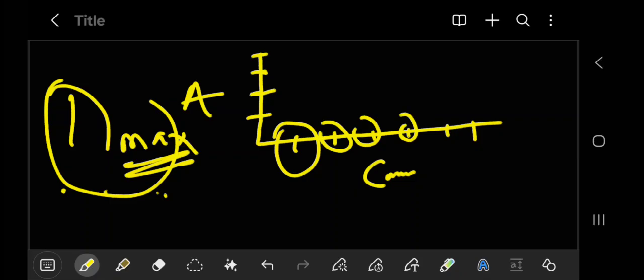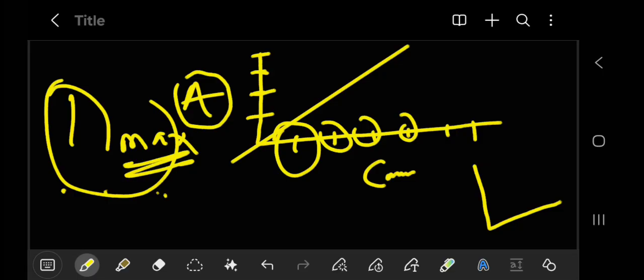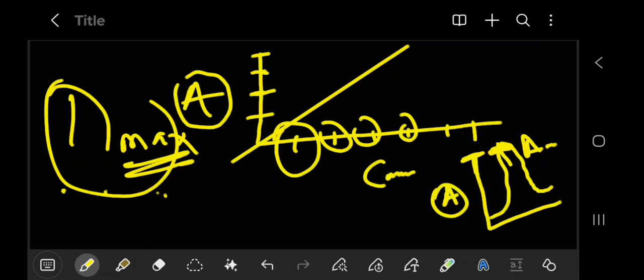So in the long run, you have a graph that looks like this: concentration of the prepared solutions against their absorbances. Then remember, the initial procedure gave you an idea of the maximum wavelength, lambda max. This lambda max corresponds to a specific absorbance.